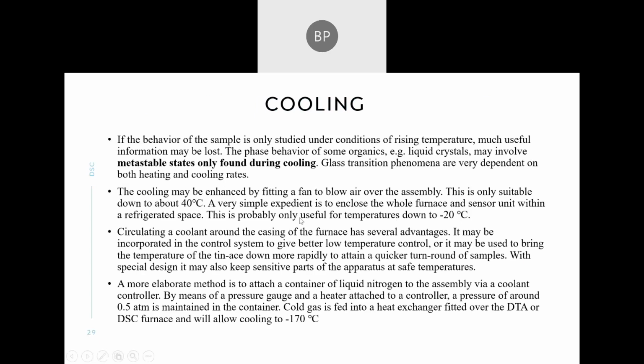So this arrangement was later replaced with an arrangement where the furnace and the whole sensor unit is kept in a refrigerated space, where the temperature can be further decreased down to minus 20 degrees Celsius. But still, sometimes in some cases in a cooling curve, we need to decrease the temperature further than that.